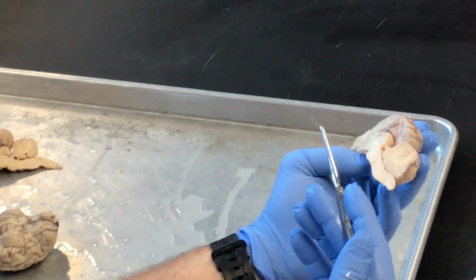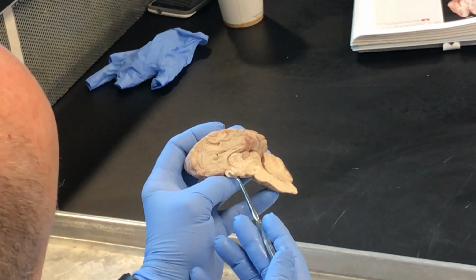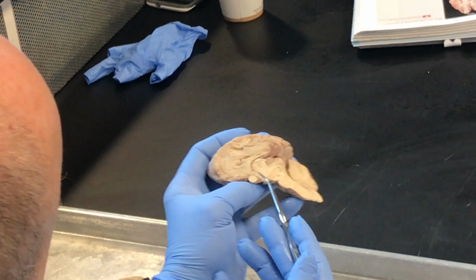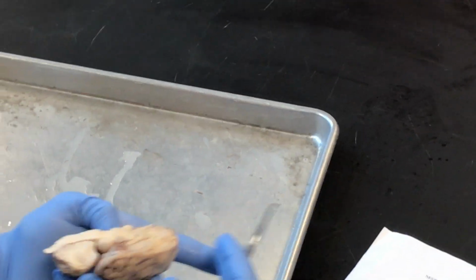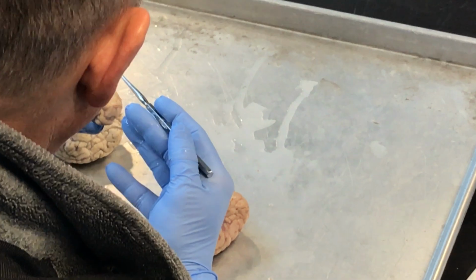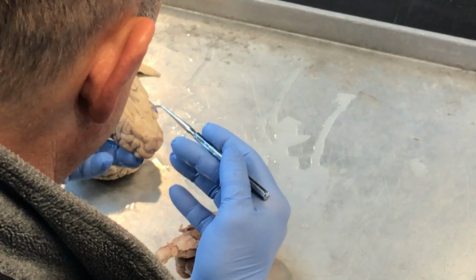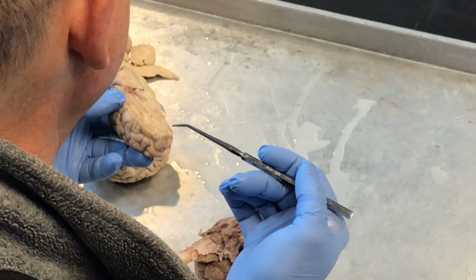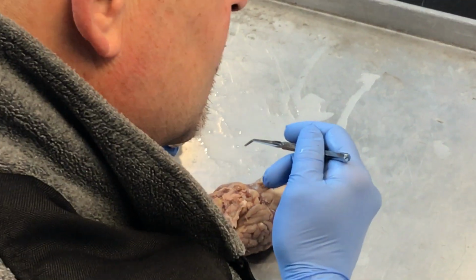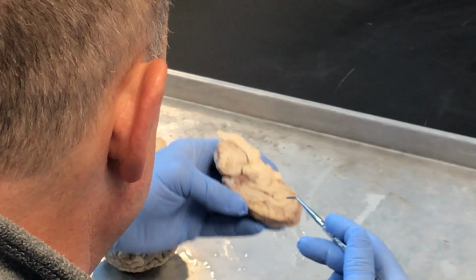So where would the hypothalamus be sitting? Well, it's going to sit below the thalamus, this is thalamus, but above the optic chiasm. So this is the hypothalamic tissue. Below intermediate mass, above the optic chiasm. Adeline, there's intermediate mass of the thalamus. This is optic chiasm. Below the intermediate mass, this is the hypothalamic tissue right there between those two. So with the hypothalamus, you have the infundibulum and mammillary body, which you won't be able to see very well from this perspective.